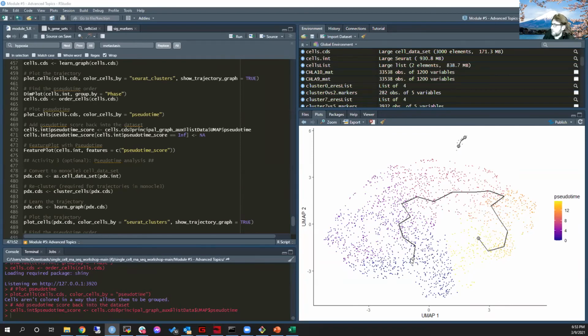So recall that the pseudotime is the time it would take to walk from the starting point to any other place on the graph. And at some point, you can walk to everything on the graph because everything is connected to each other by the same trajectory. But there's a few cells that are not part of this graph. Yeah. Okay, so Tyler got it.